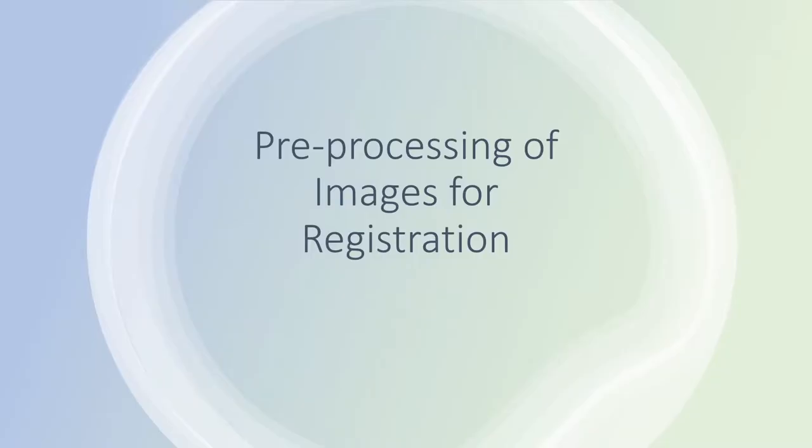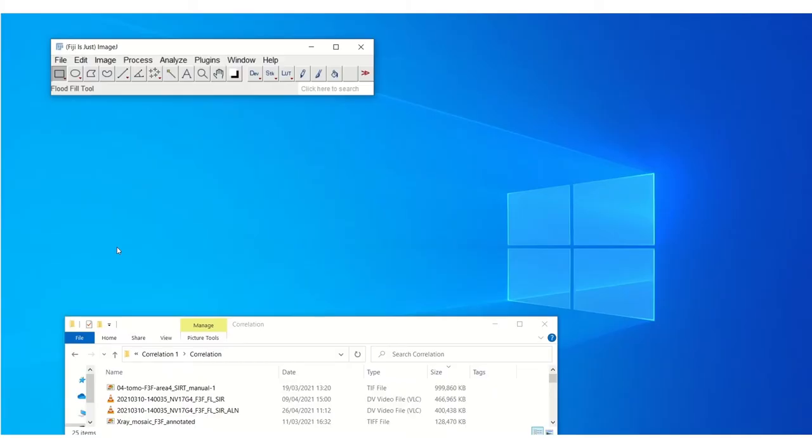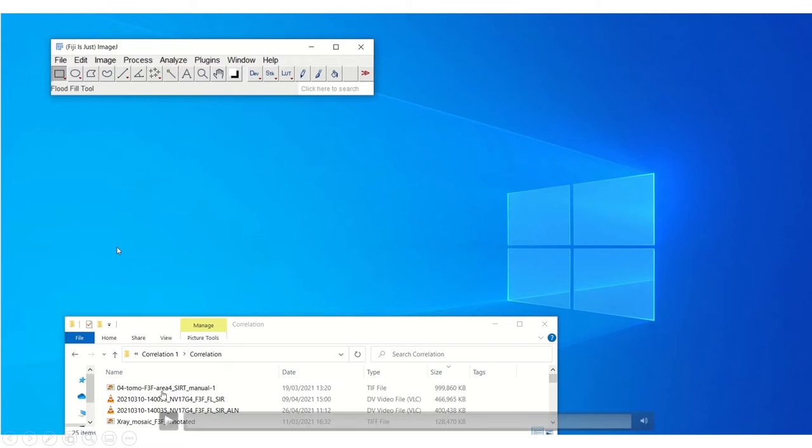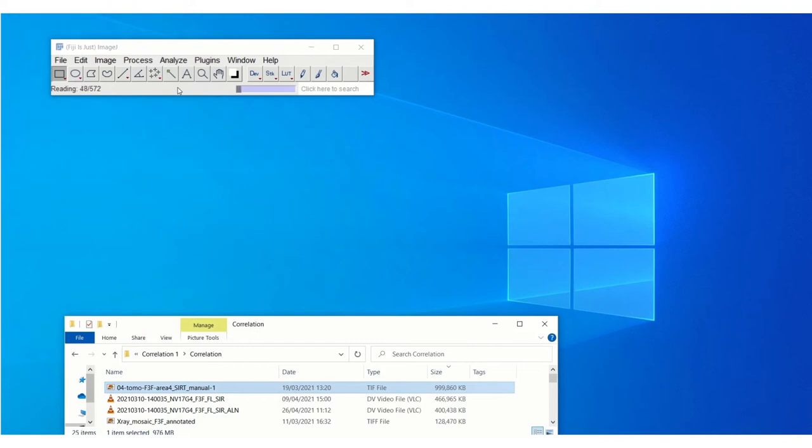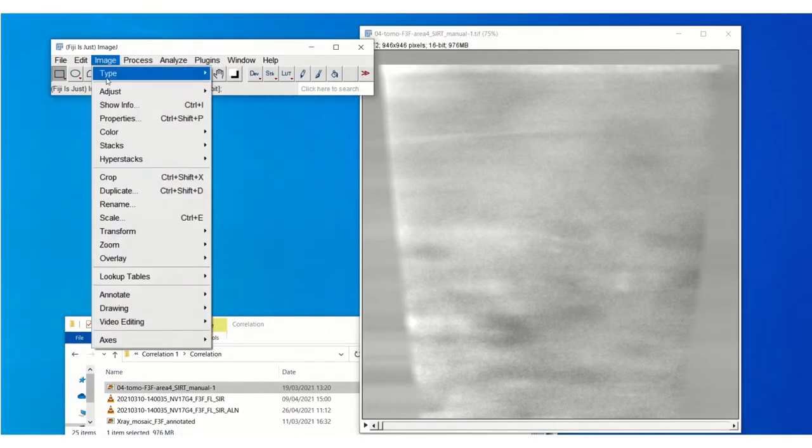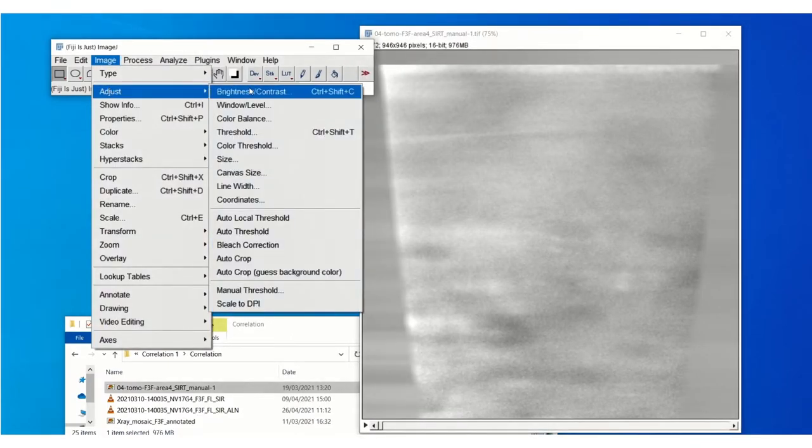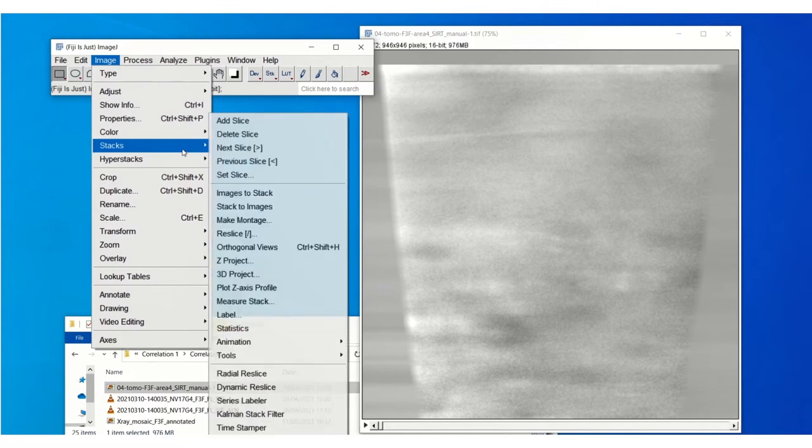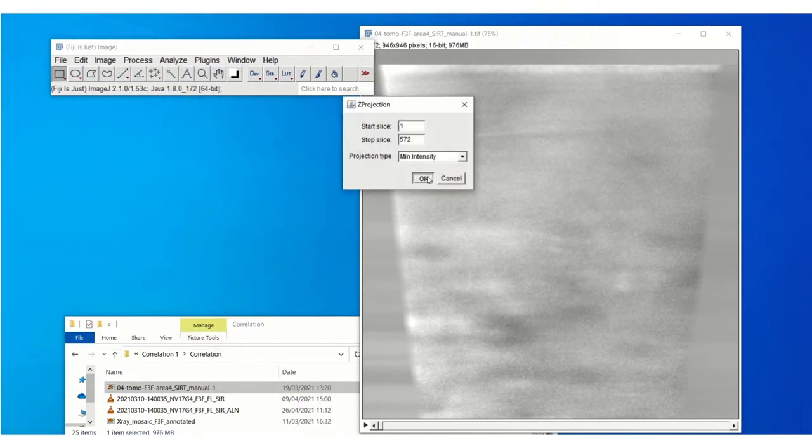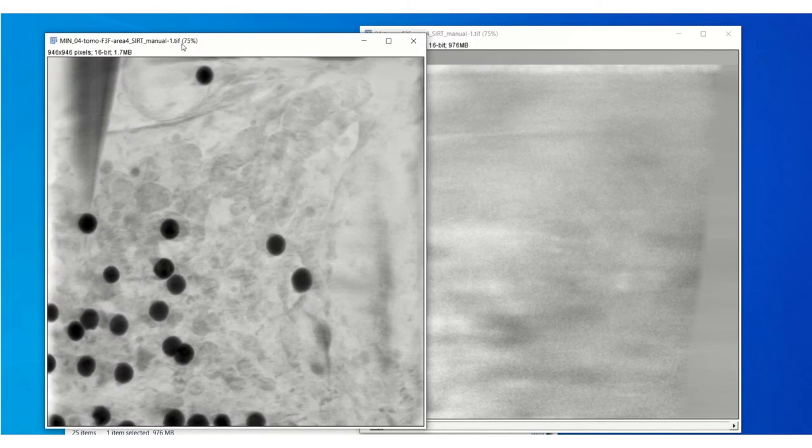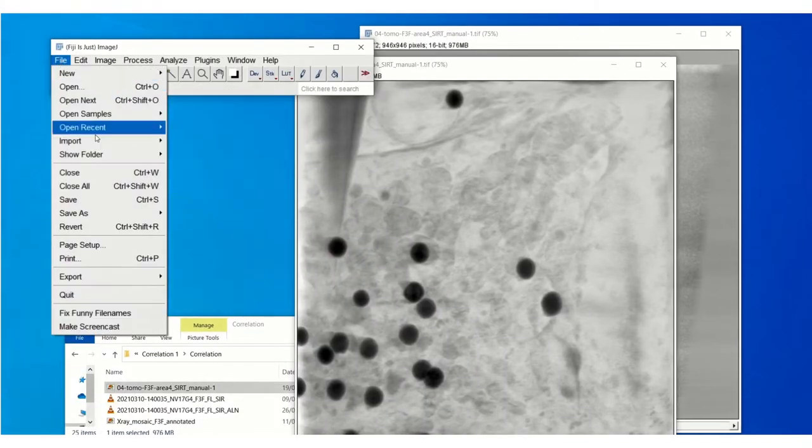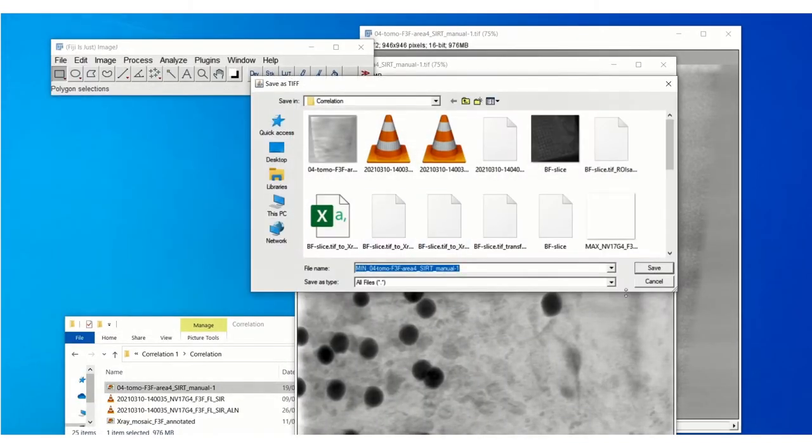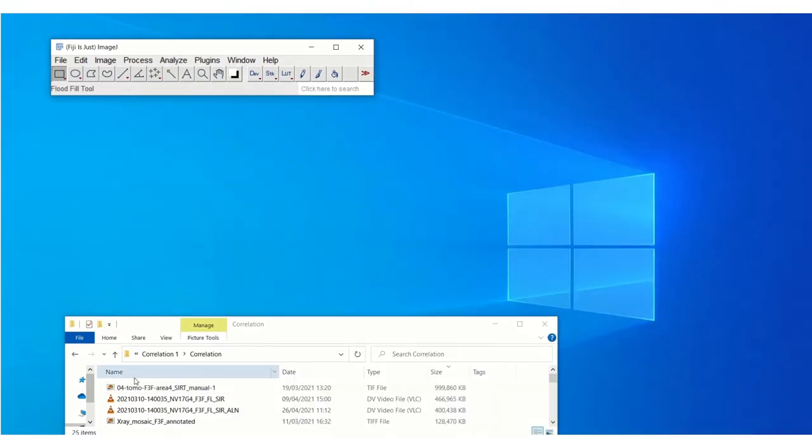Before we do the registration we just have to pre-process the images. This is just to make sure that any 3D images are converted to 2D for the 2D registrations. Here we're using Fiji to do some minimum and maximum intensity Z projections. For the tomogram we will do a minimum intensity projection. You can either do this or you can extract a slice depending on which image gives more information and then save that in the relevant folder.